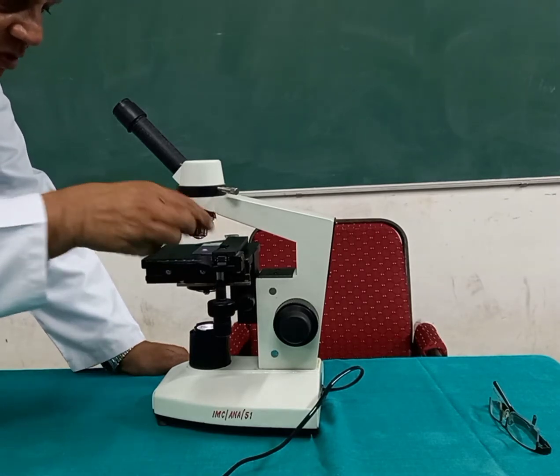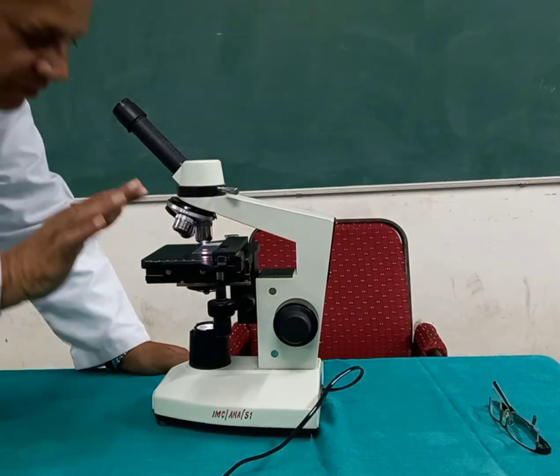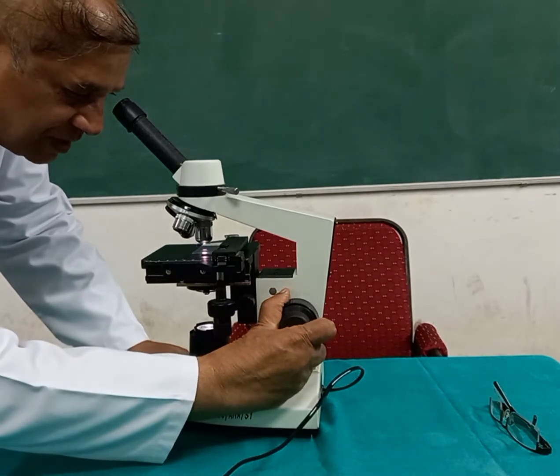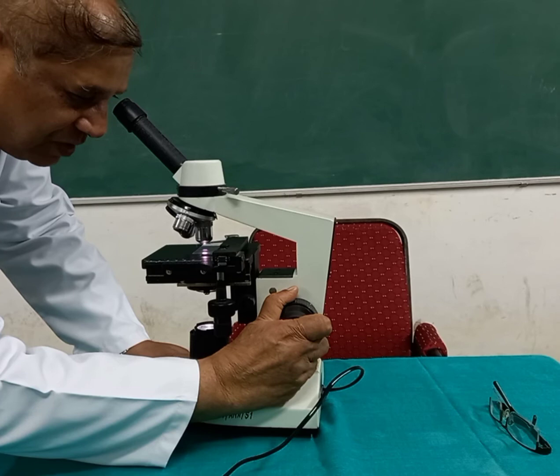So I will just rotate this slightly to the 10x. Once it has come to the 10x, again I will move the coarse adjustment and try to focus it, and I will need less movement.